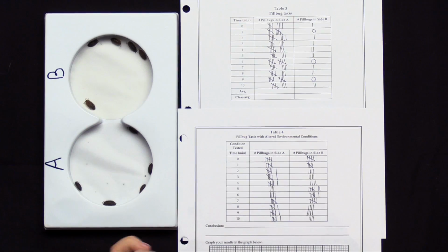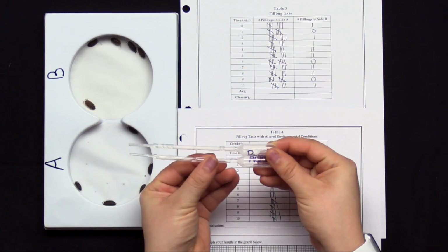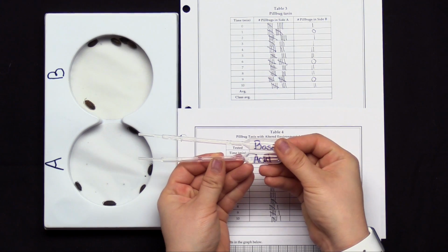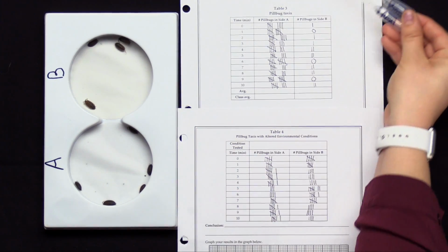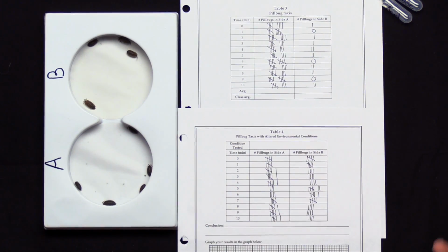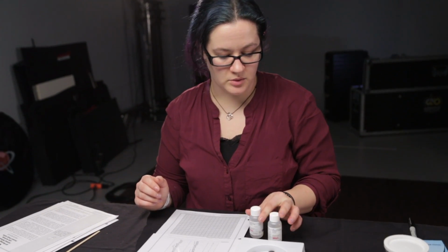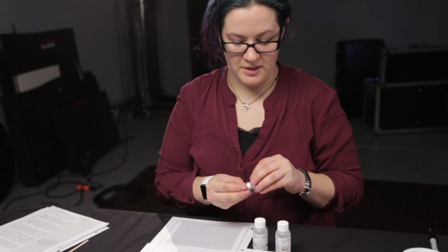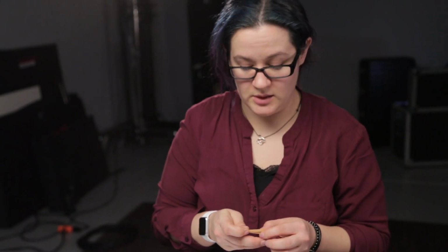So there's a couple of things that we can do just to make sure that we did the experiment right, now that we need to validate our data. One of the things I did when I set this up is I set up my pipettes and I labeled them as acid and base to make sure that there wasn't any cross-contamination. So I can double check that. But maybe I want to make sure that I didn't mess up my acid and bases, so I can test and make sure that the experiment is what I think it was.